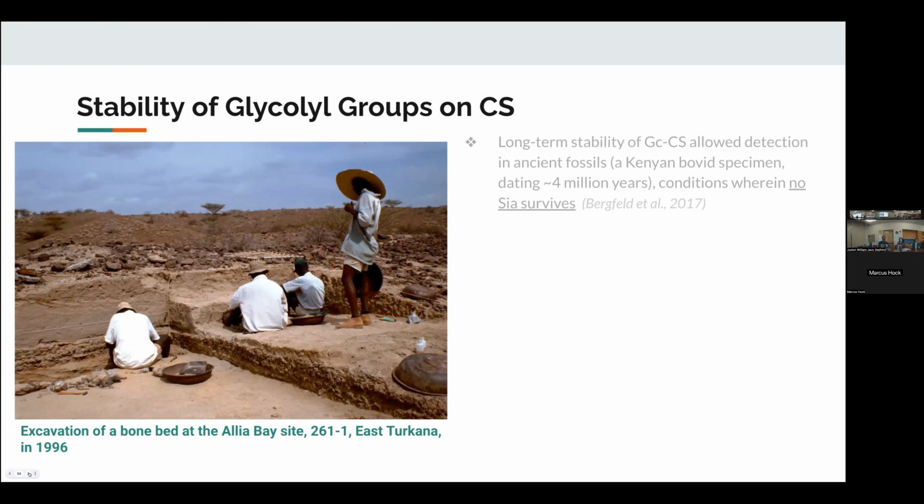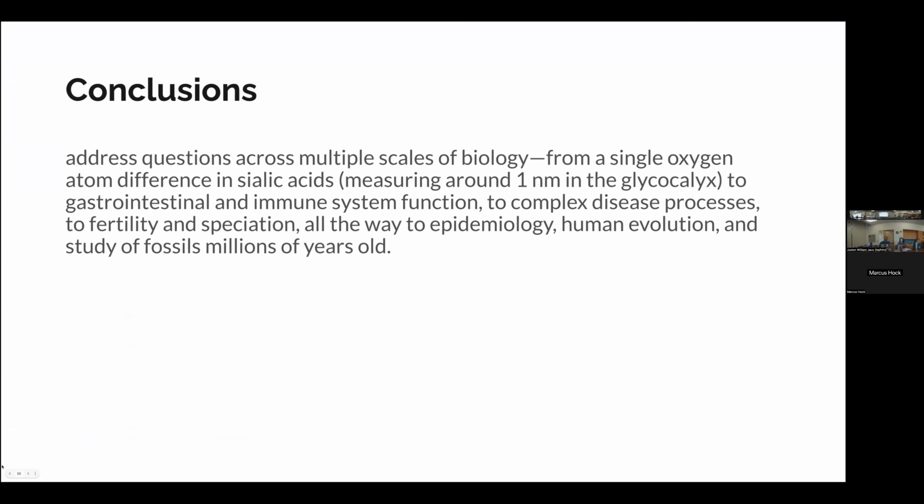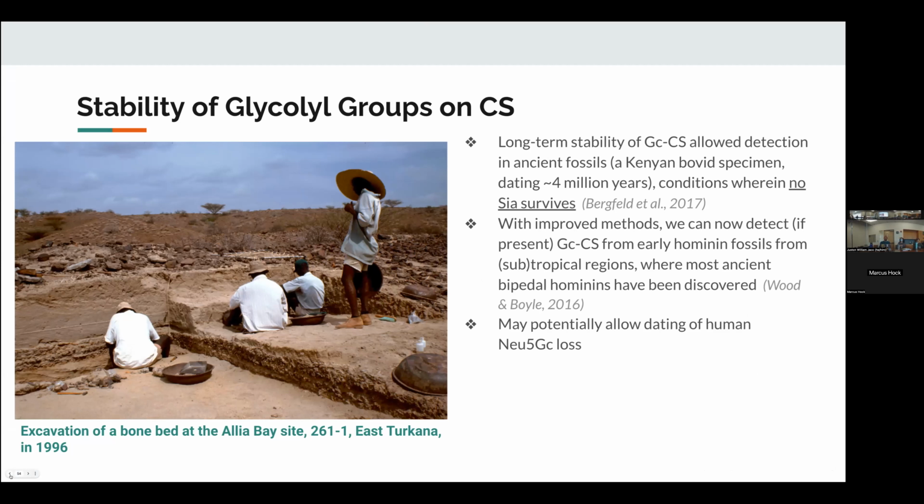So I'm really hopeful that I can get my hands on some bones, some ancient fossils, or collagen extracts to look at this as well. Because it's a very simple technique. You extract it, you treat it, you filter it, and then you run the samples on mass spec. You treat it with chondroitinases to chop up the disaccharides so you can have a good signal. And then once you have that, you can actually start to make sense of who leads up to who, which I think is really exciting, and I'm hopeful.